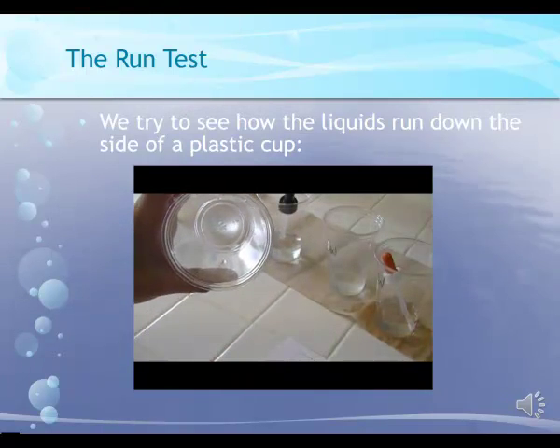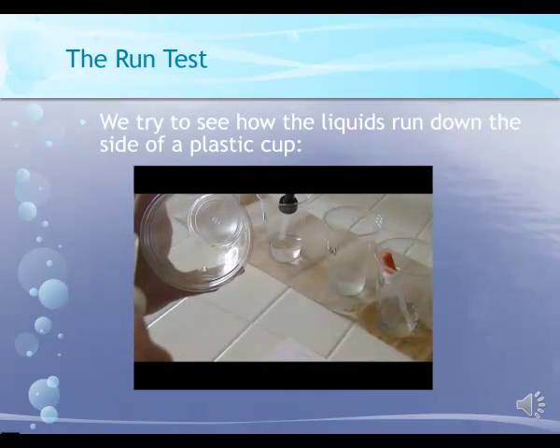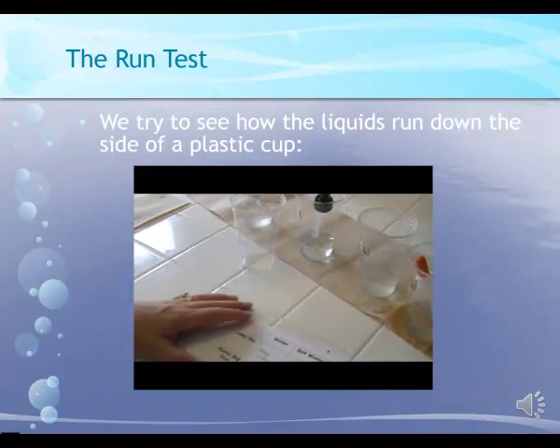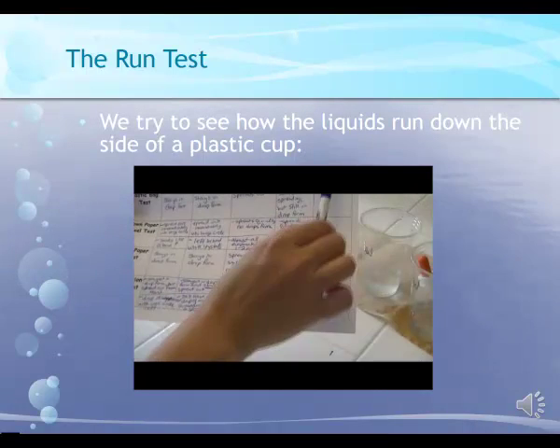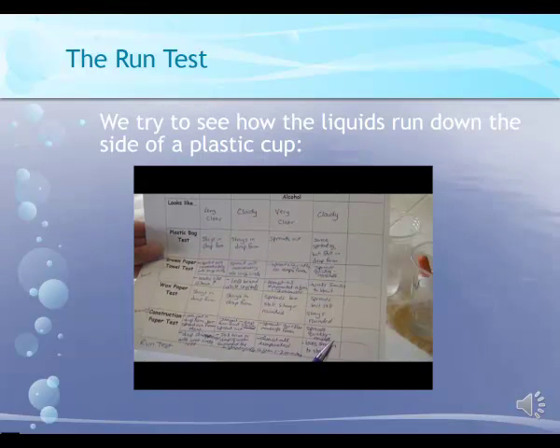Oh my goodness. It didn't stay in drop form either. It spread out and away it went. Okay, so that was the run test down here. So I'm going to fill in my chart, and when I come back I'll have an unknown liquid and we can test it and compare what we've seen and what we've done.